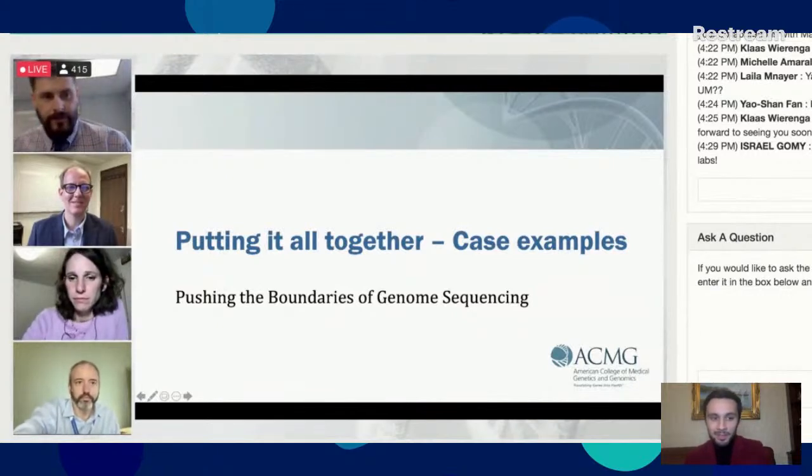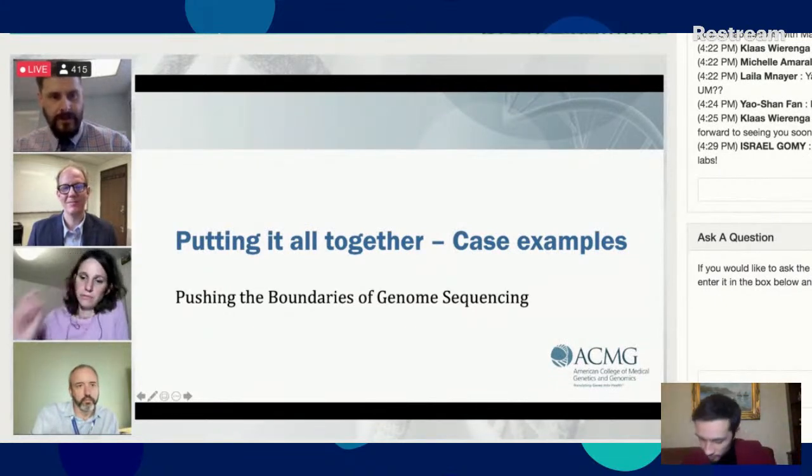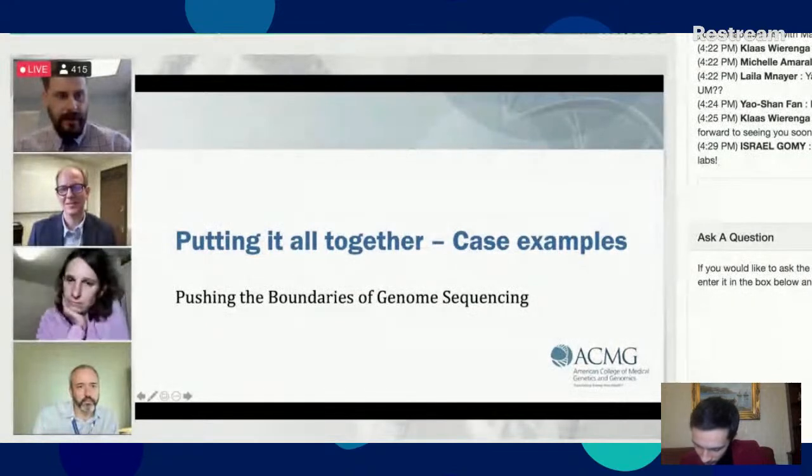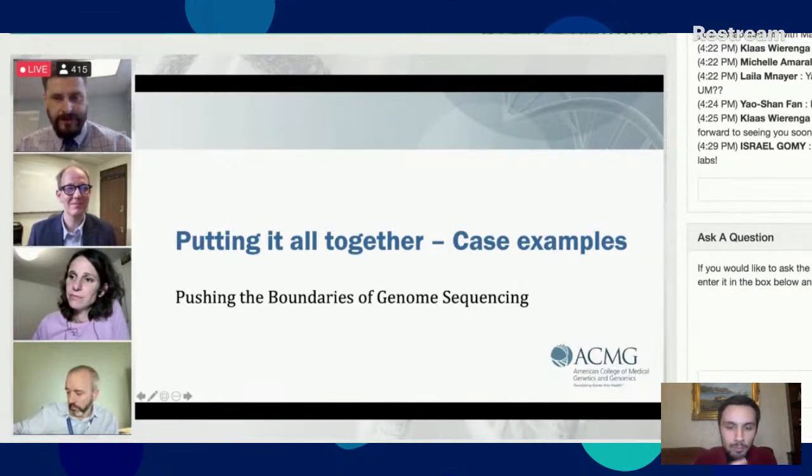All right. Thanks, everyone, for your attention during those pre-recorded sessions. So what we'll need to do now is, as you can see, we have our speakers back in the live Q&A format. And I think what we'll go to now is we'll just jump into some case examples. There's a number of questions in regards to size and those kinds of things.